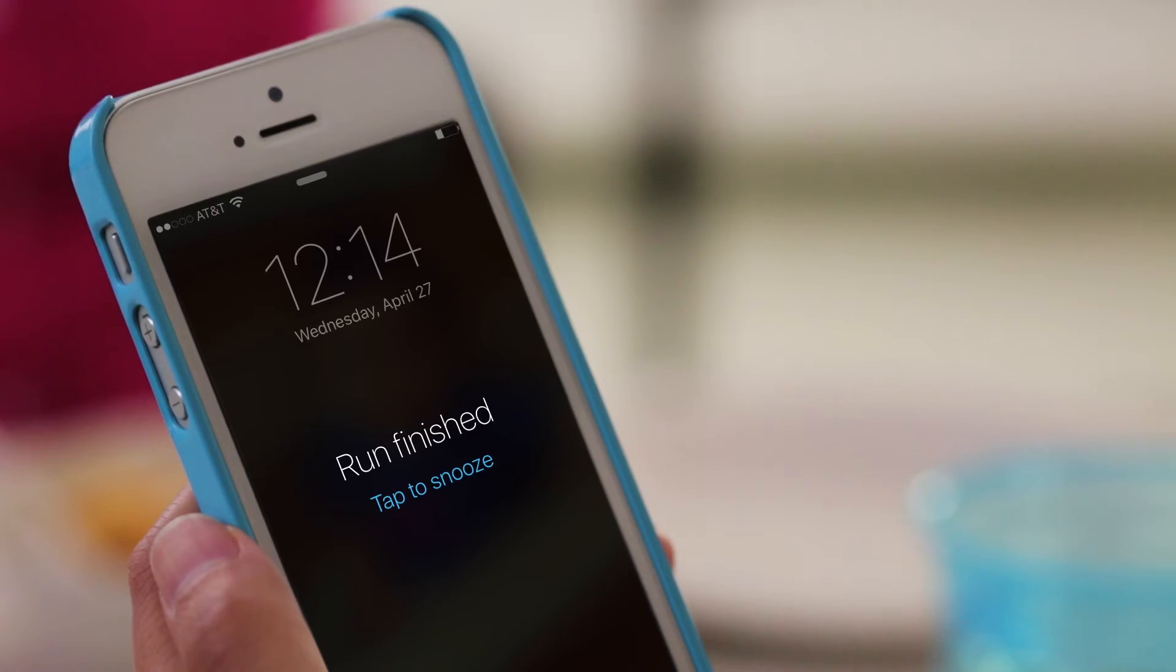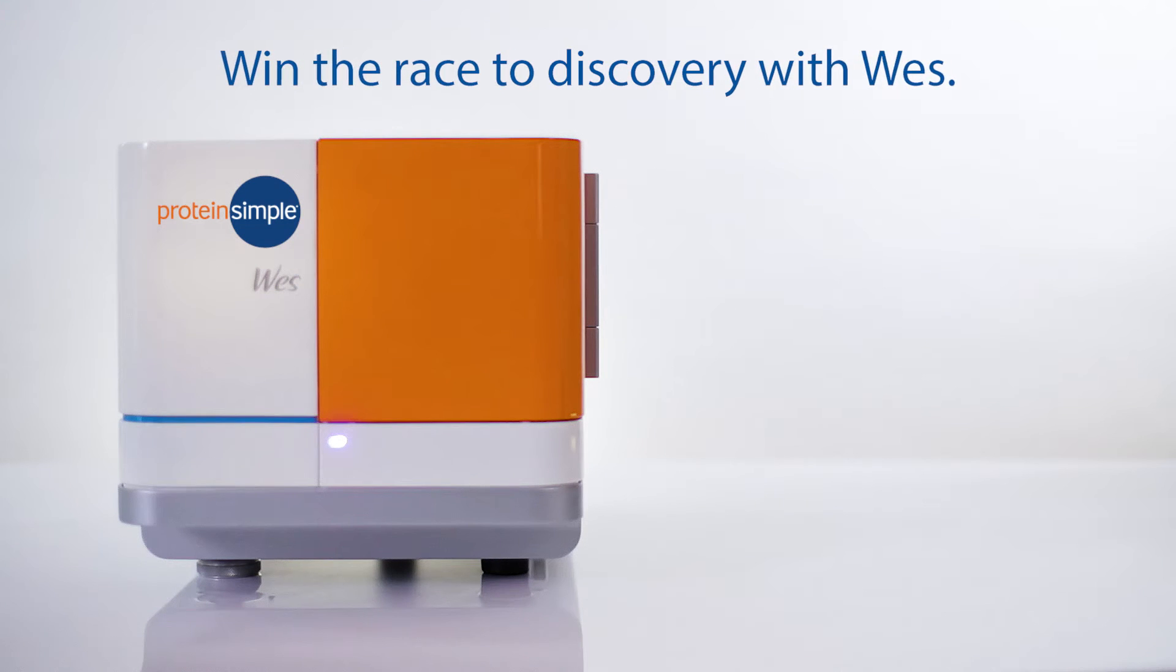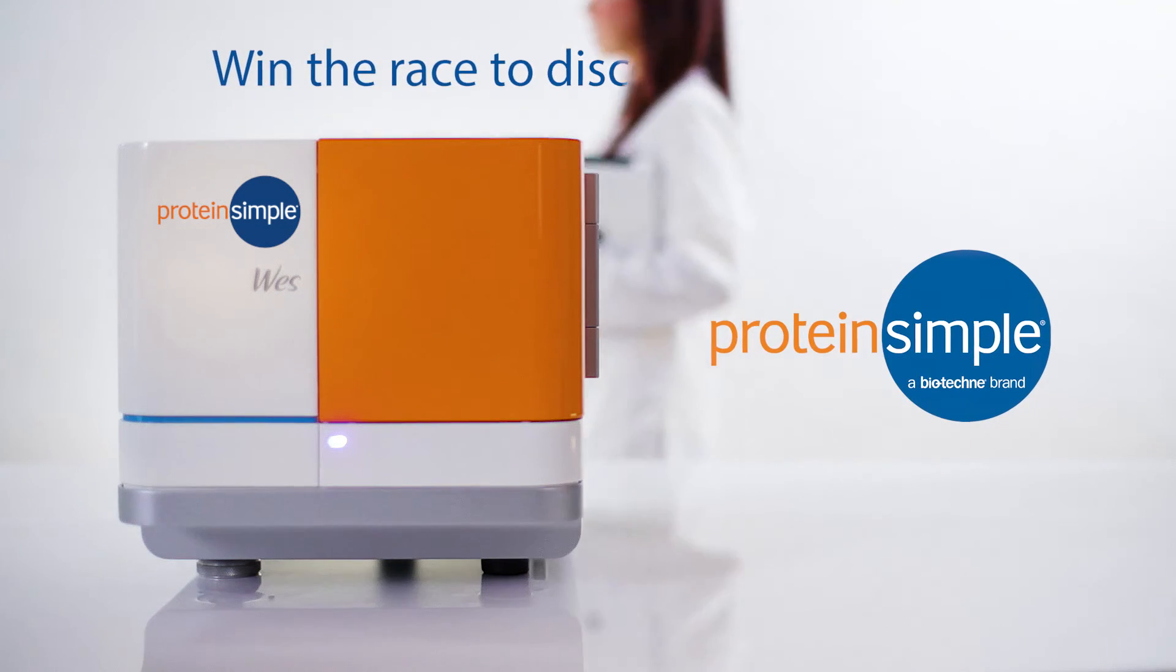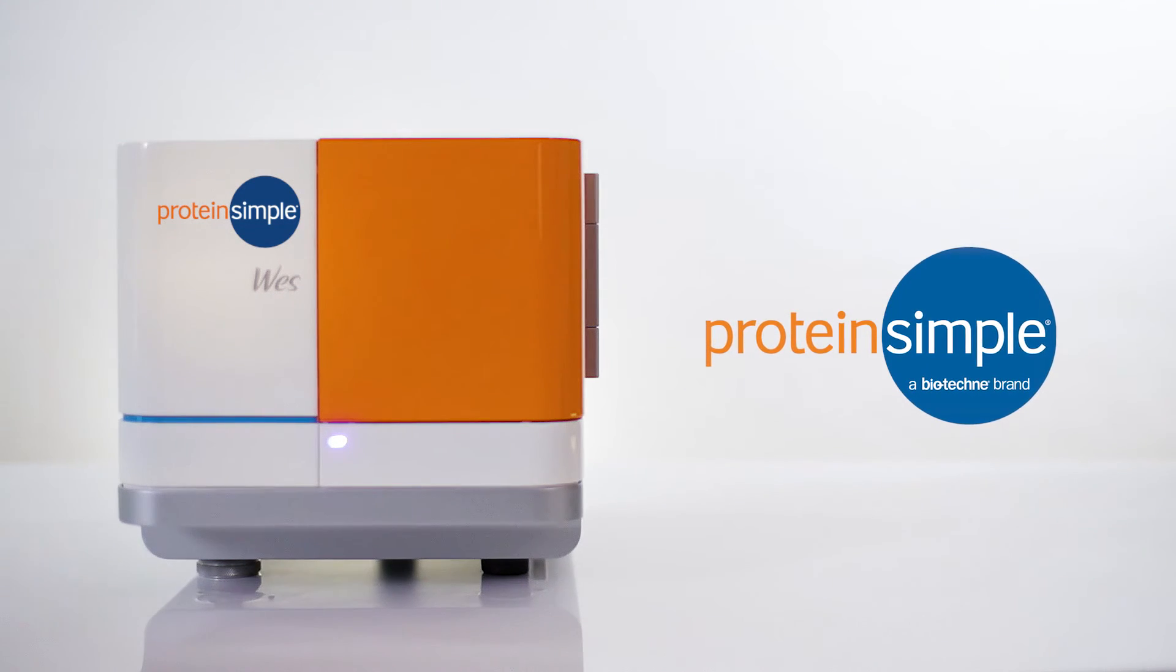Stop waiting three days for results you can have in three hours. Win the race to discovery with Wes. To learn more please visit the ProteinSimple website.